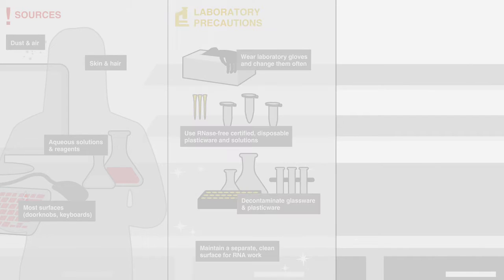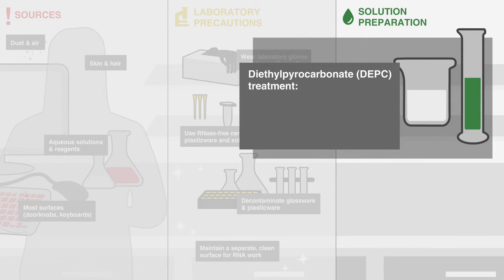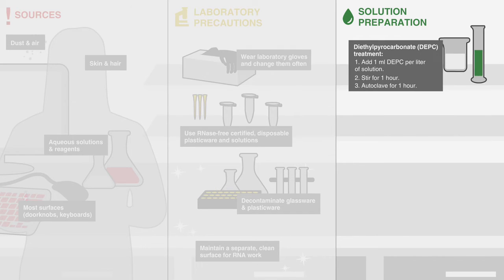How can you prevent contamination during solution preparation? DEPC treatment of solutions is accomplished by adding one milliliter DEPC per liter of solution, stirring for one hour, and autoclaving for an hour to remove any remaining DEPC.